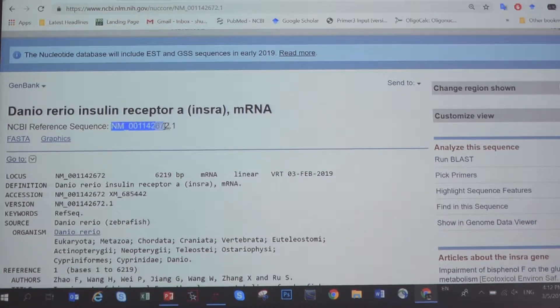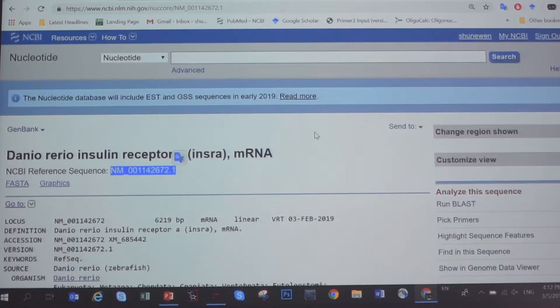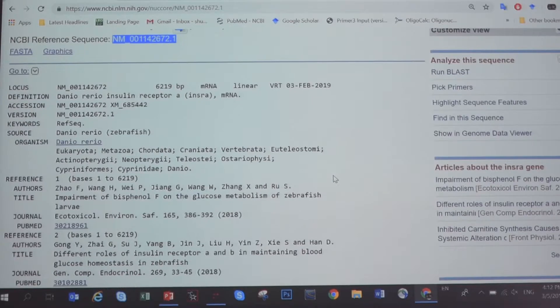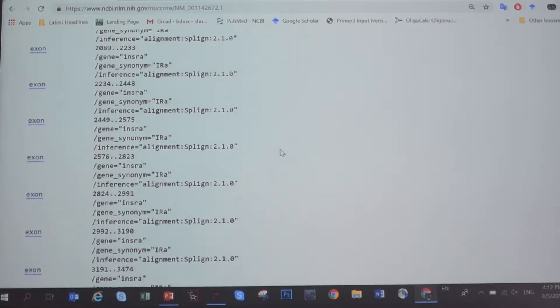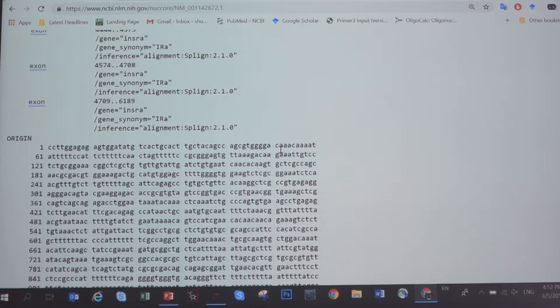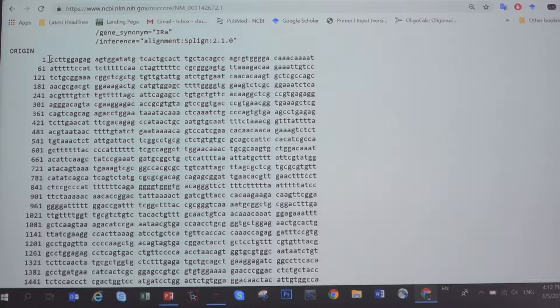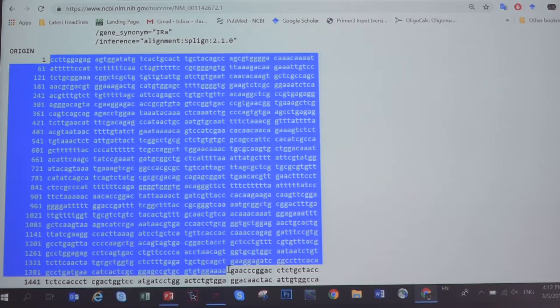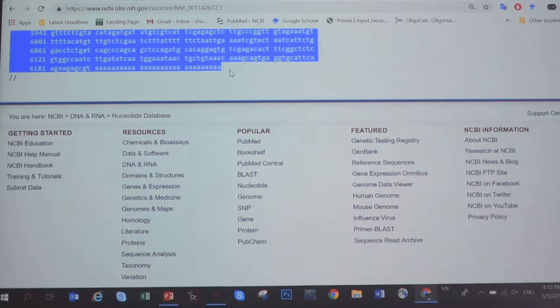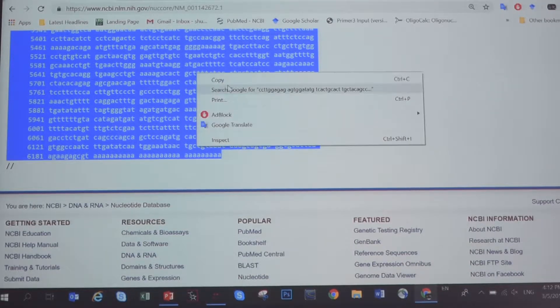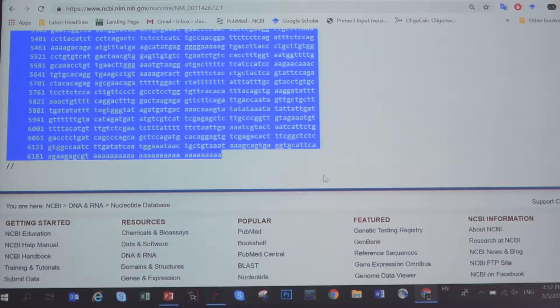You can download this sequence from GenBank. You can pause the video to retrieve the sequence. Once you have the sequence, scroll all the way to the bottom, highlight and select all the nucleotide sequence — just left click and hold to select all — then right click to copy.